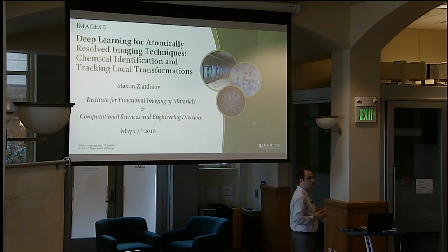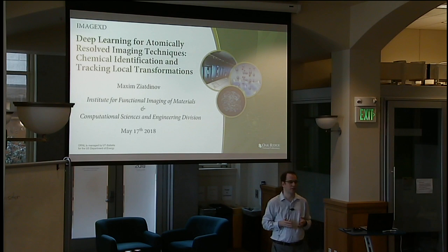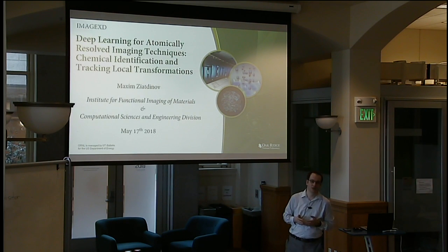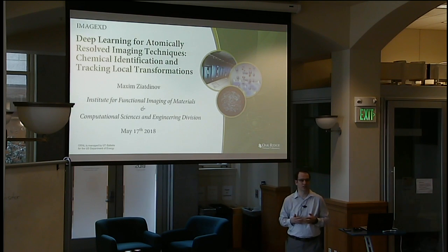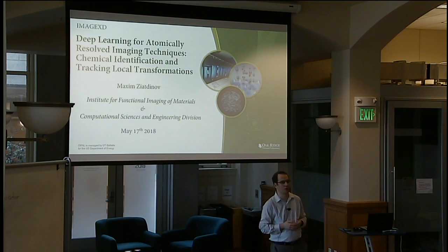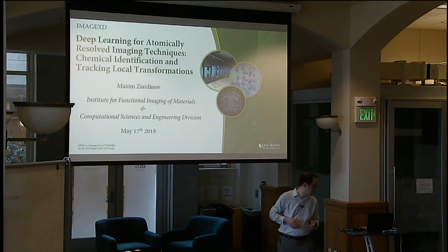So today, I would like to talk about how we can use deep learning for atomically resolved imaging techniques, specifically for scanning transmission electron microscope and scanning probe microscopies. I will mostly talk about electron microscopy.